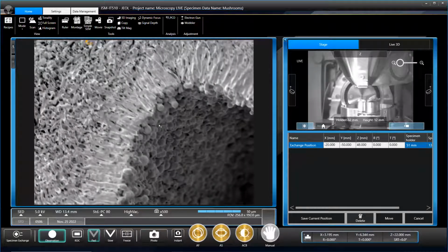So should we focus a bit more? Yeah, focus a little bit more. If it's out of focus, you want to just bring it back the other way, because it's all happening live. Which bit should I be focusing on here? Depends which bit you're interested in, it's a different plane. I guess I want to go on this inside bit.